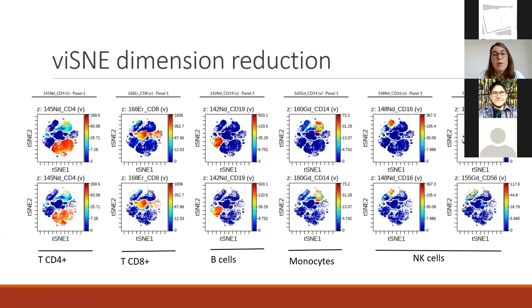So if you move to the second plot, now it's CD8, and you can see that the red here is in a different location, okay? So like this, you can compare your samples. Let's make a very simple comparison. If you see CD14 in my graph, the cells are located here in sample one. If I look at sample two, I have much fewer CD14 cells. So perhaps I can hypothesize that CD14 is reduced in sample two, which is equivalent to my group B, let's say, depending on what you're comparing.